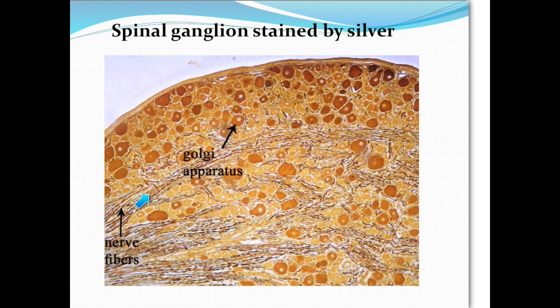Why do we have brown coloration for these nerve fibers? The brown coloration here is due to the staining of the neurofibrils, 2 micrometers in diameter, in the nerve fibers by the silver. And as I said before, these neurofibrils are nothing but neurofilaments stuck together to form a larger bundle due to the process of the fixation used during preparation of the slide.